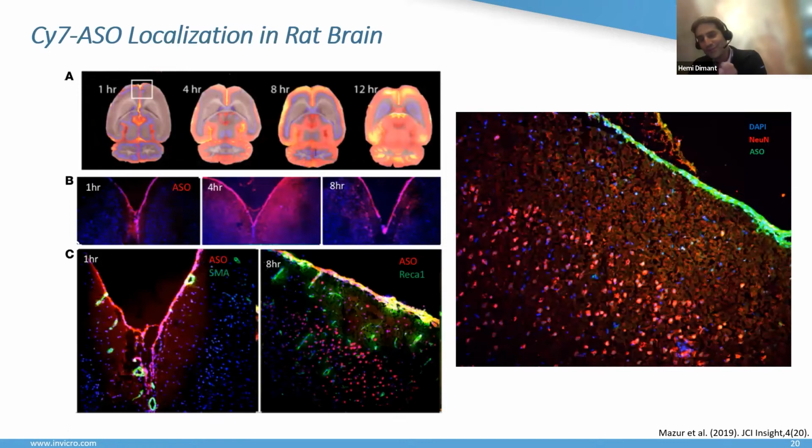And further than the CFT data, which allowed us to suggest or indicate that we are seeing penetrance into the brain, we collected sections and conducted immunofluorescence. Here, the sections were collected on glass slides from mid. So we start the CFT process. We've collected sections and run several immunofluorescence assays to characterize in which type of cells the ASOs are ending up: neurons, macrophages, microglia.